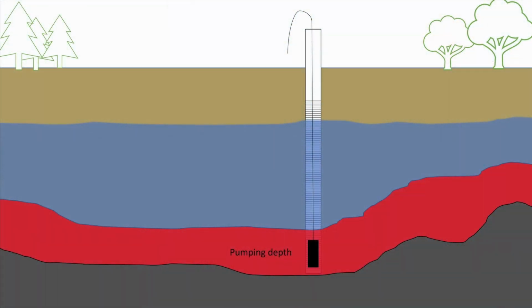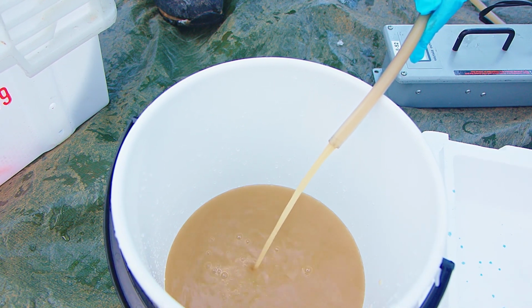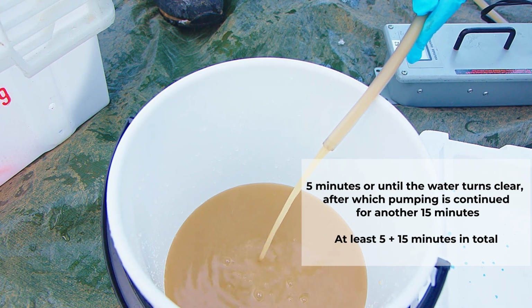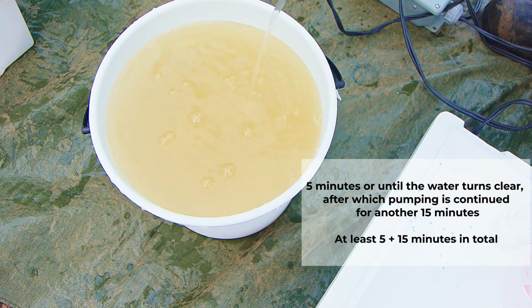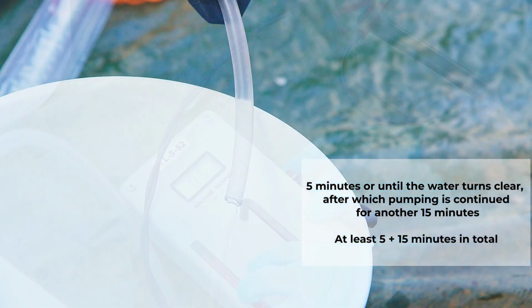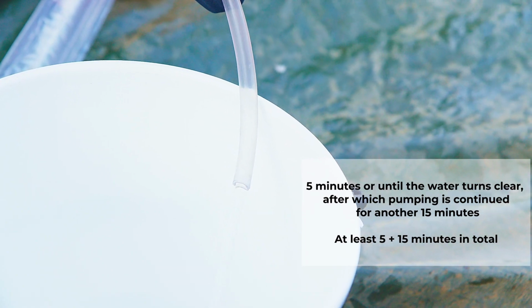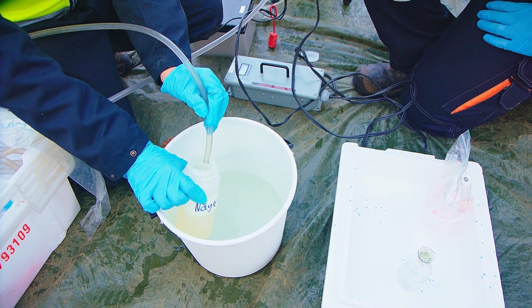Pre-pumping begins by pumping 8 to 10 liters of water per minute for at least 5 minutes, or until the water turns clear. After the water turns clear, the pumping power can be increased and water is pumped for at least 15 more minutes before taking a sample. The total pumping time is therefore at least 20 minutes, during which time 100 to 300 liters of water is pumped up from below. By then, the water in the well has been replaced several times. Once pre-pumping is done, the actual groundwater sampling can begin.